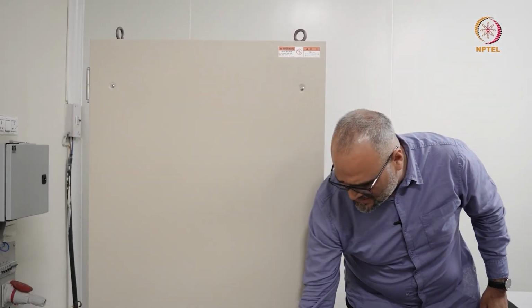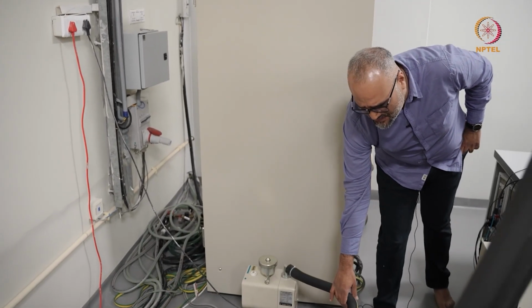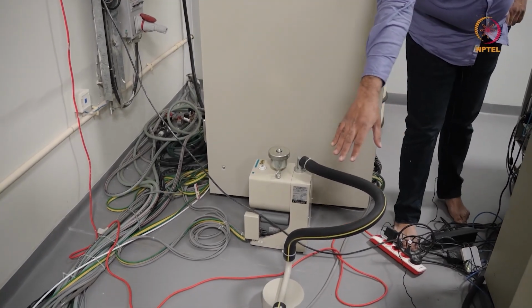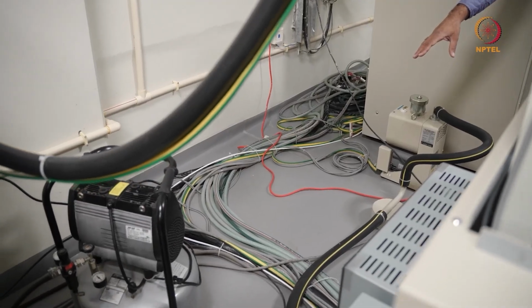We'll quickly have a look at a few more details here. So this is your roughing pump. There's a little lead block in which the vibrations are damped, and the power console and the tubes here are to supply or circulate chilled water into the microscope column.